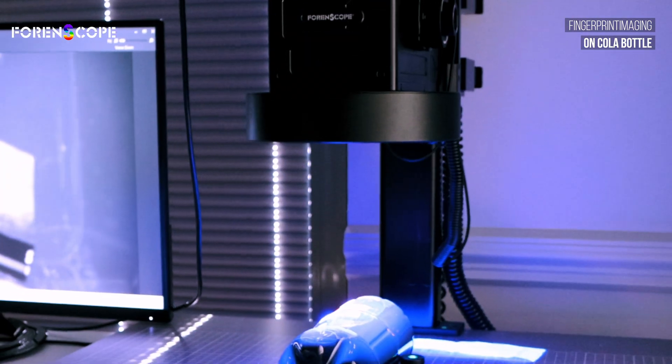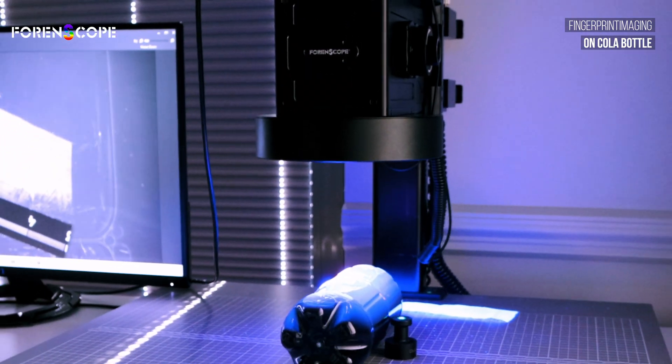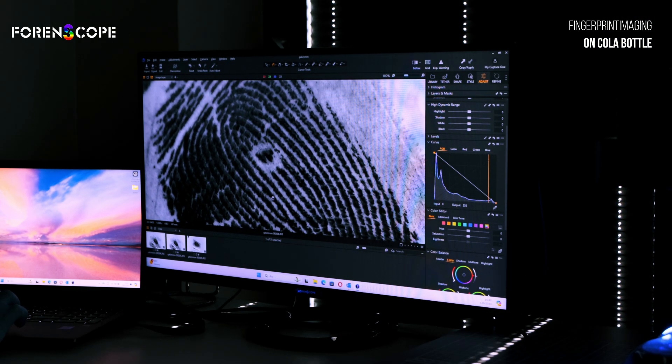Experience it with our ergonomic copy stand, built for comfort and speed. Minimal expertise needed — anyone can use it effectively.